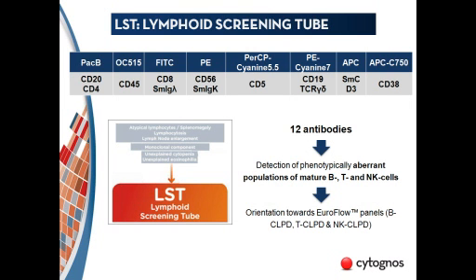So those are the suspicions when we are going to apply the LST, for example, monoclonal component, or unexplained cytopenia, or unexplained eosinophilia, lymphocytosis, lymph node enlargement, or atypical lymphocytes, or splenomegaly. If we have those aspects and we don't know what it is, we're just going to apply the LST to see if the problem of the patient is B population, T, or NK.